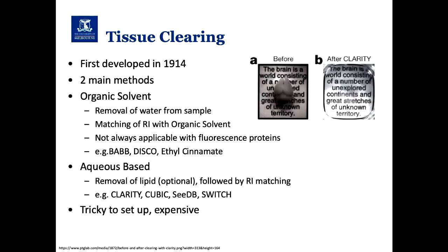It's not the type of thing where you're going to decide you want to do tissue clearing and then next week you're going to have your samples perfectly clear. It takes a bit of time to develop the techniques for your specific tissue. And some of the techniques can be very, very expensive.